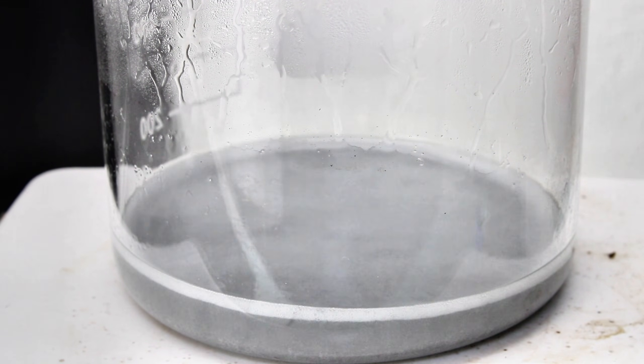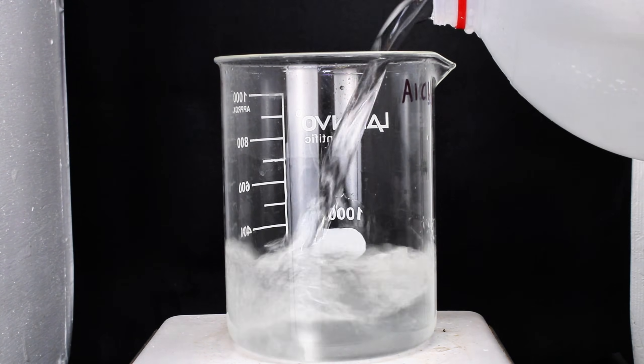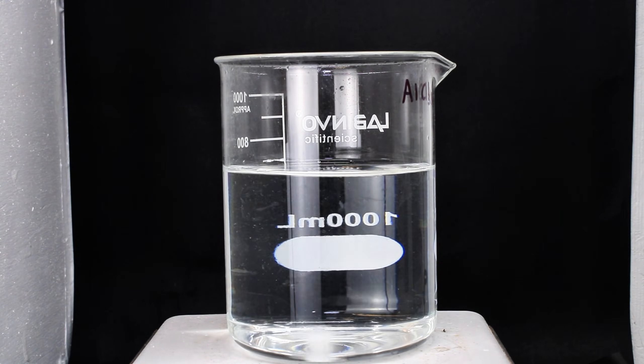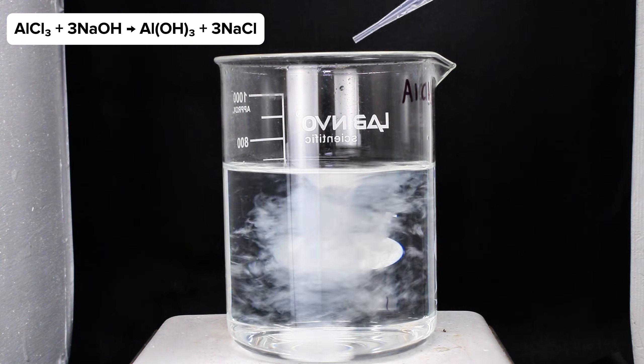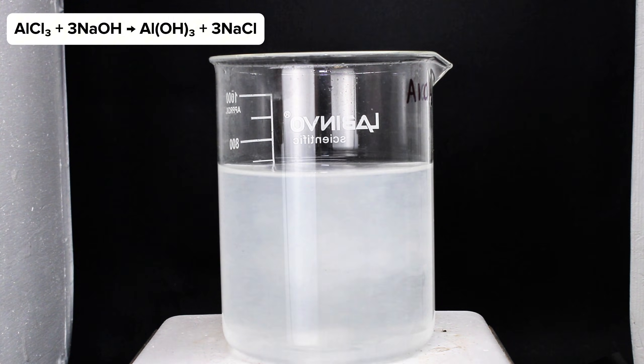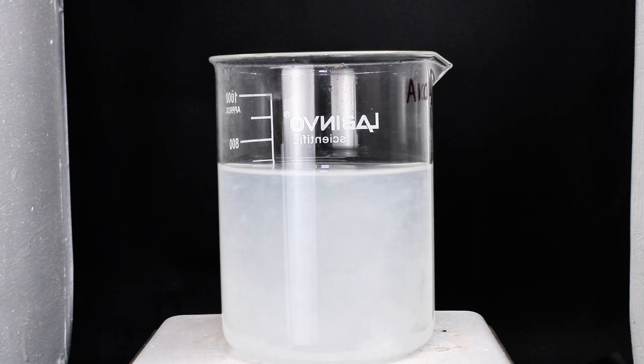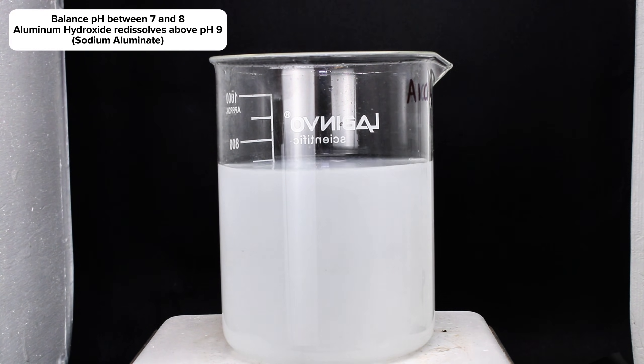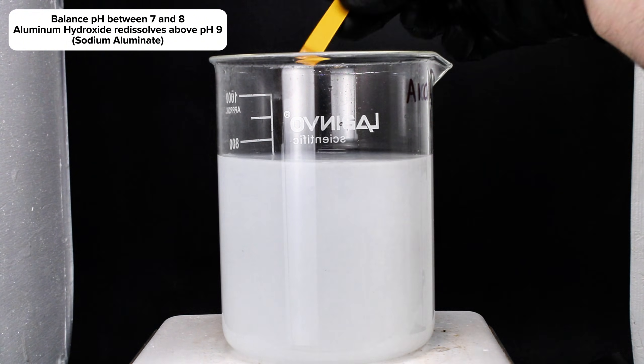it was next diluted with a large excess of water and slowly neutralized under constant stirring using 2 molar sodium hydroxide. This is a simple displacement reaction that results in the formation of soluble sodium chloride and insoluble aluminum hydroxide. It is important in this step though to only continue adding the sodium hydroxide until the pH is between 7 and 8, and this is because once the pH increases past 9, the aluminum will begin to re-dissolve as sodium aluminate.